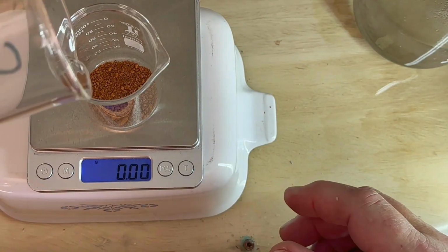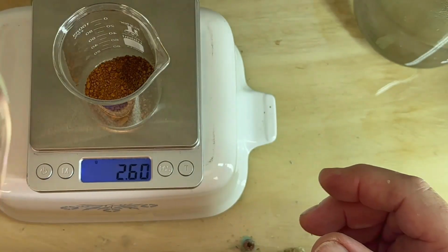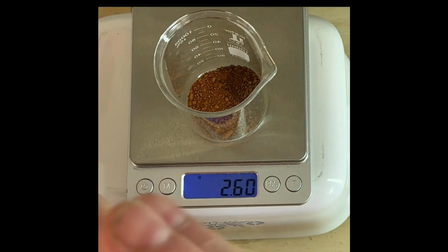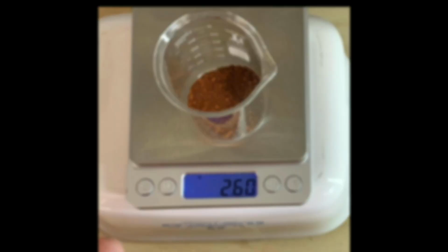Get it over so you can get a better picture of it. And from there, we have 2.6 grams of gold. Not the cleanest. You can see that a little bit dark color, but gold all the same.